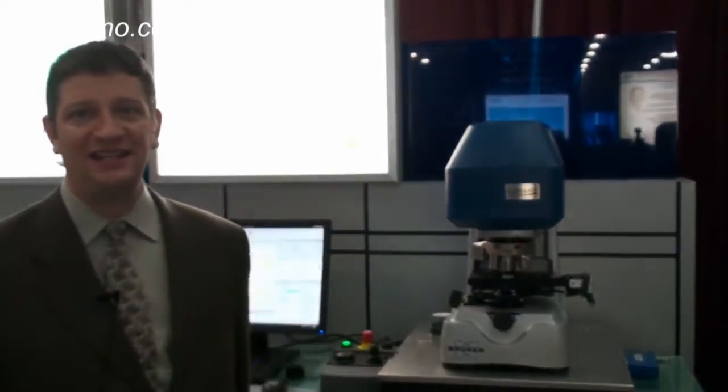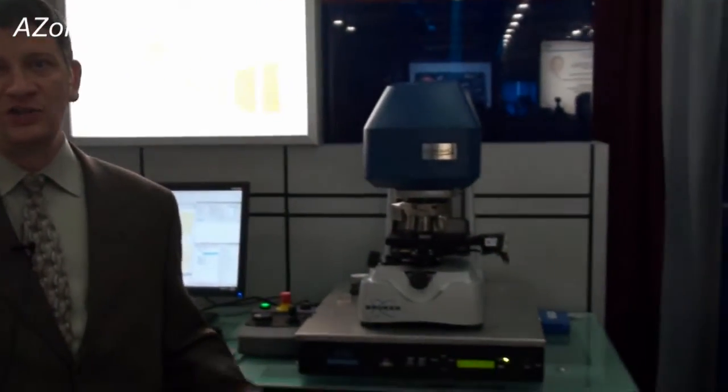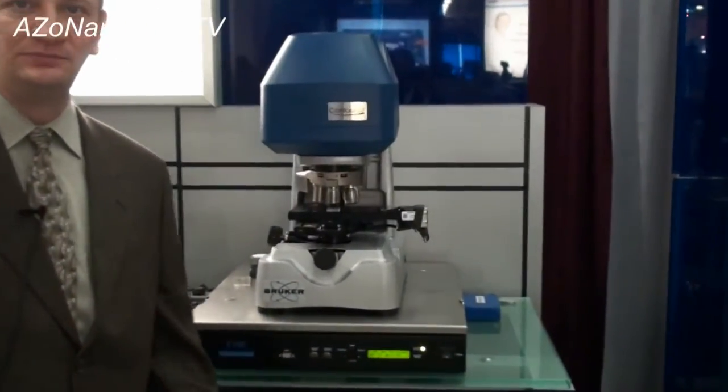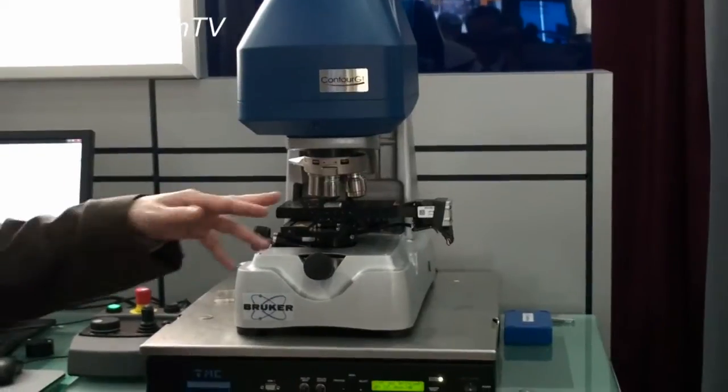Thanks Cameron. So this is our Contour GT K1 Optical Profiler. It's a white light interferometric optical profiling system.